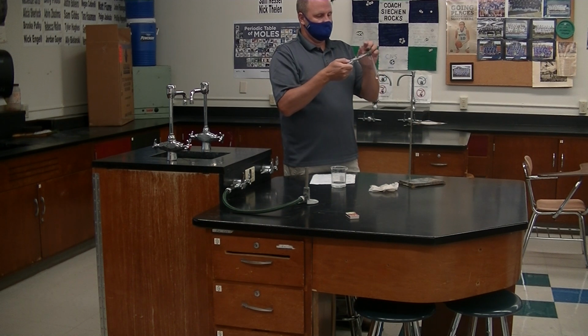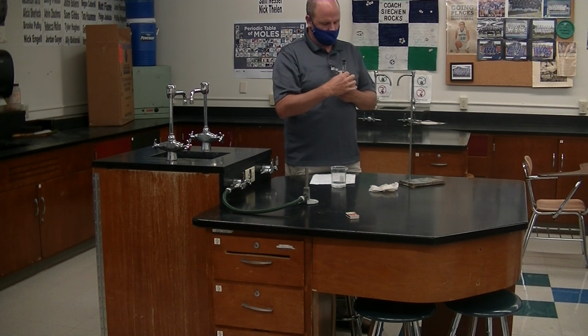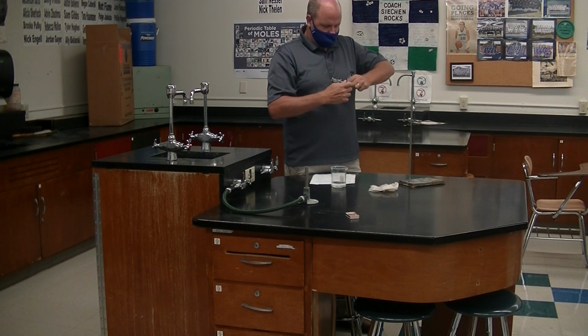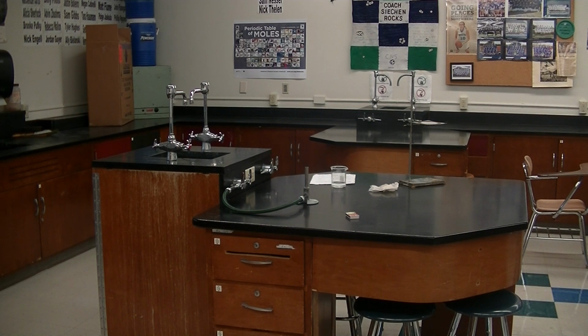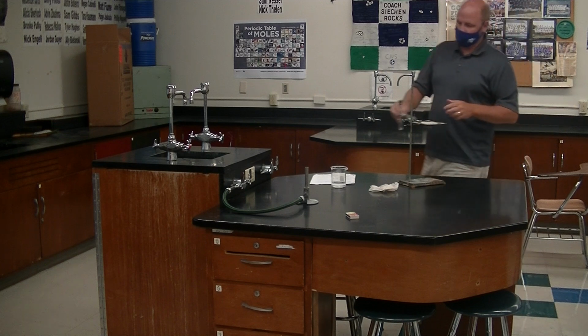This is called, ooh, didn't put it tight. Now, I told you what this was called, right? Did I tell you this one? What's this one called? Test tube holder. This one is a test tube clamp. What makes it a clamp? Because you can clamp down. And I'll talk about what we're going to use this for in a minute.